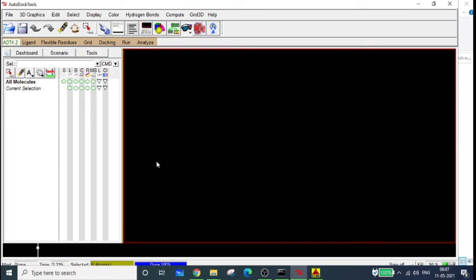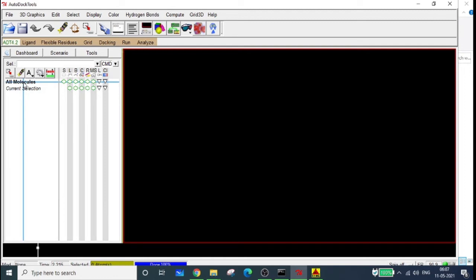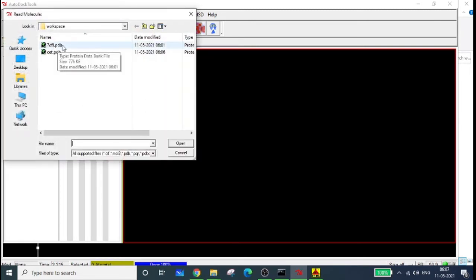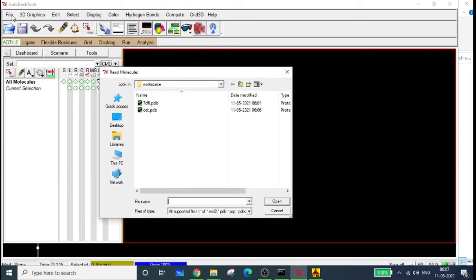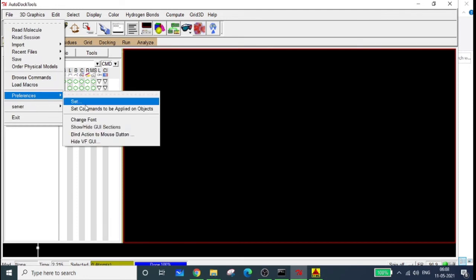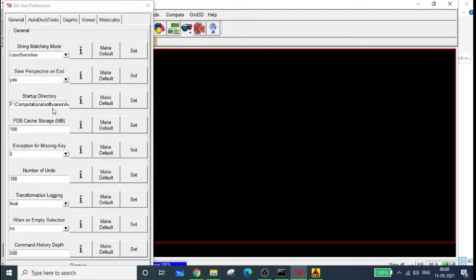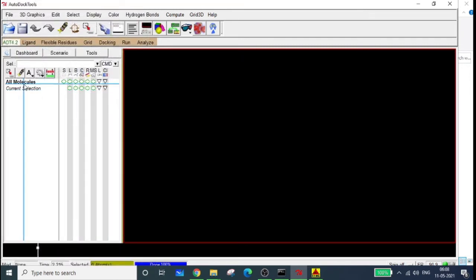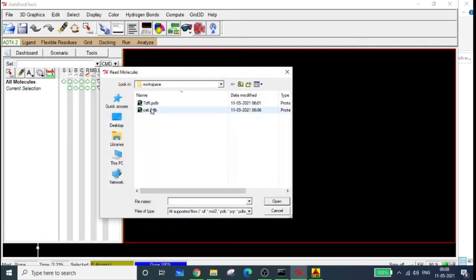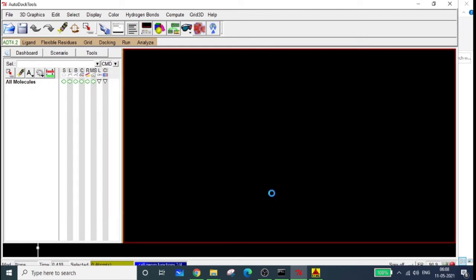Now we're going to start docking. First we have to prepare our protein, then our ligand. To import your protein molecule into AutoDock Tools, go to 'All Molecules', right-click, and select 'Read Molecule'. It will go directly to your workspace if you've set the file preference startup directory correctly, as mentioned in the previous video. Select 7DFL.pdb and open it.